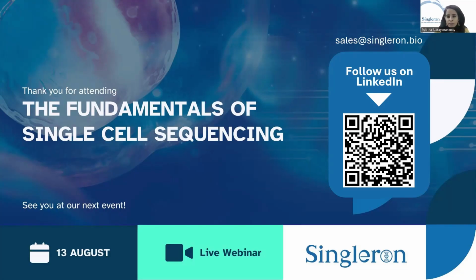As I showed in one of the slides, because it's nuclear, you will capture a lesser number of mRNA, because the amount of mRNA is probably about 30 to 40% of what it would be in a single cell, but the capture method is exactly the same. So what you have in the nuclei, you will capture by the same method, but it will be slightly less than single cell just because the nuclei have less mRNA comparatively.